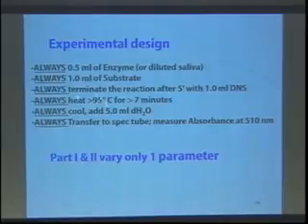You then always heat greater than 95 degrees C for 7 minutes. That drives the reaction of the DNS with the reducing unit, that aldehyde, the linear form. You then cool it, add 5 mL of water so you get enough sample for the spec tube, and then transfer and measure OD. And we always want to vary only one parameter in an experiment. Only one parameter. That's good experimental design. So I did this again in red because this is always true.